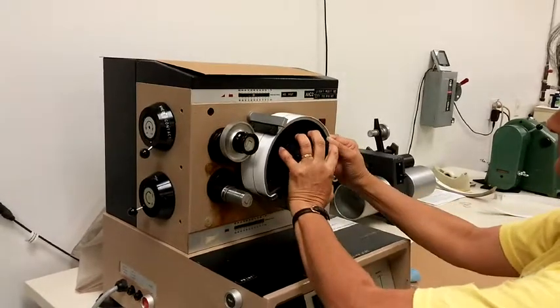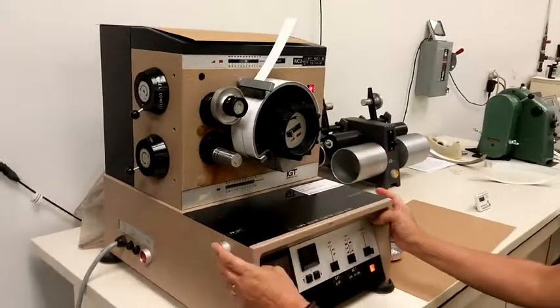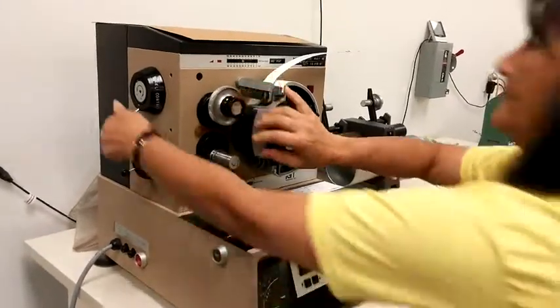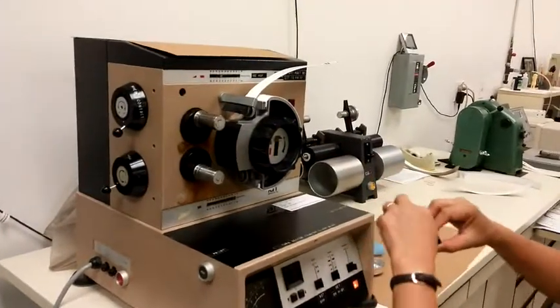The oil is applied to the disk with a standard IGT inking unit. The oil is transferred to the sample surface while under acceleration, with the application speed increasing from 0 to 4 meters per second during the application.